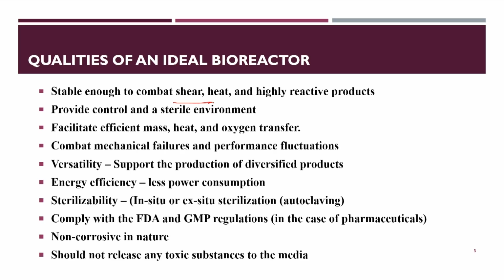So, what should be the quality of an ideal bioreactor? The first thing, it should be stable to combat shear, heat and any reactivity by the product, because your product may be reactive and it should not react with the bioreactor material.